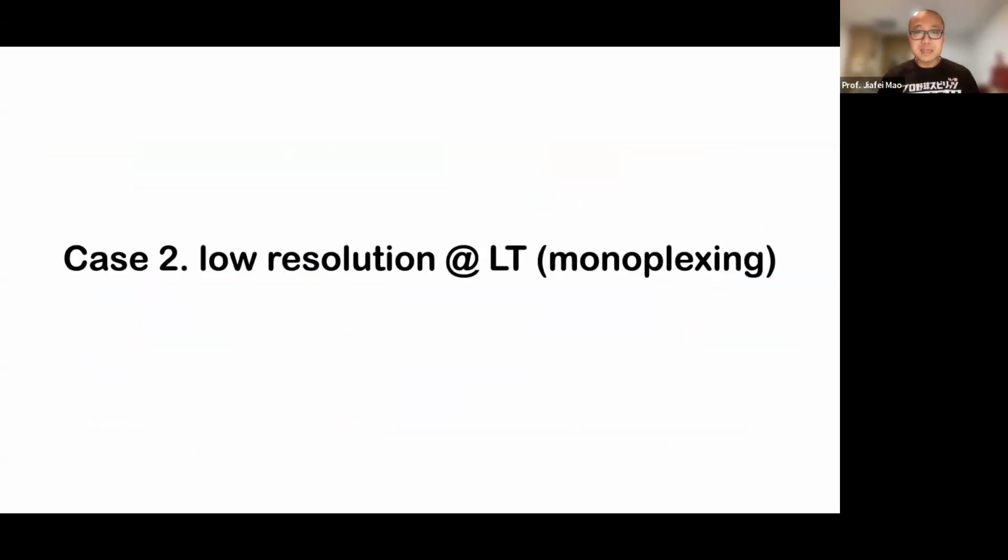But in many cases, maybe your sample will not be so good. So what if the resolution is not good at low temperature? Then we have to pick more of a monoplexing approach.